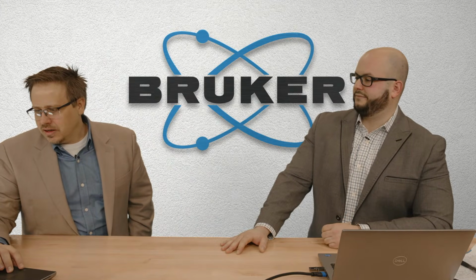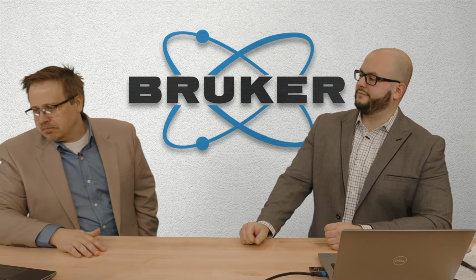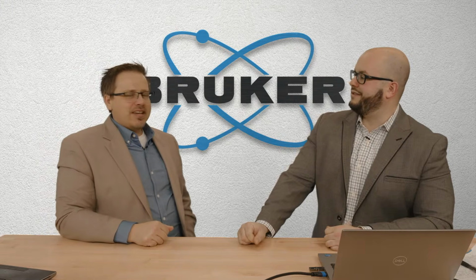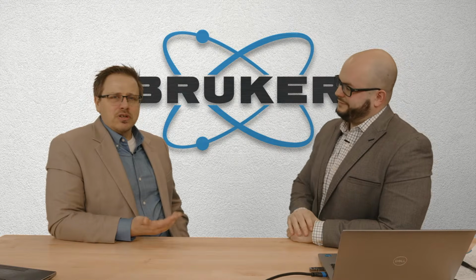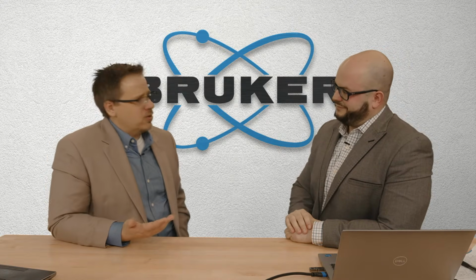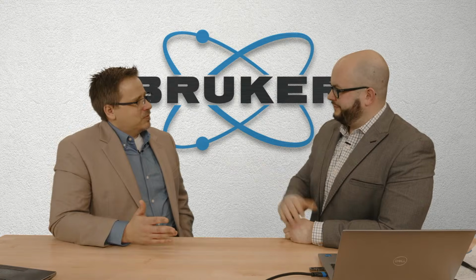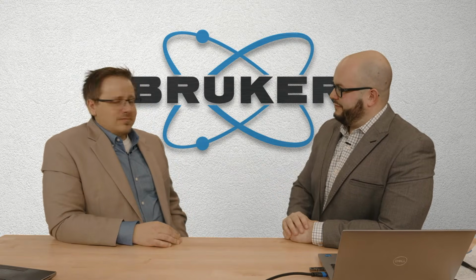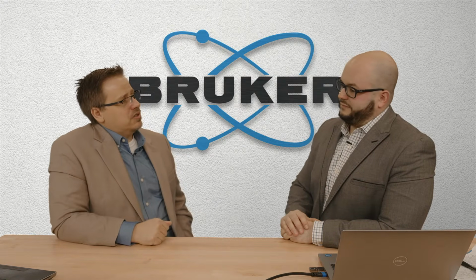All right. And then one more question that came in from Abdel. How to measure residual stress in thin films? How thin? Well, I would say we have two types of thin film. Something I like to refer to as a coating, like chrome on a bumper, generally 100 microns, maybe 50 microns, randomly oriented. So you would just apply the normal method. Now, what if we get down to a micron or less, but still randomly oriented?